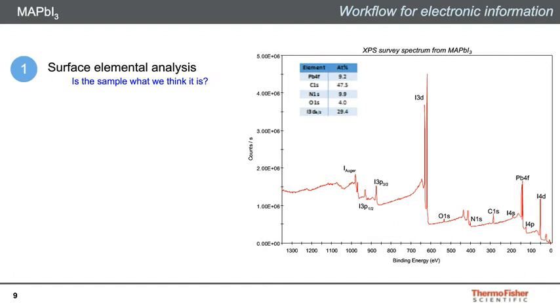The intensity of the various peaks is proportional to the element, and we can then quantify those elements in the surface. In fact, XPS can quantify all elements except hydrogen and helium without having to use reference standard materials.